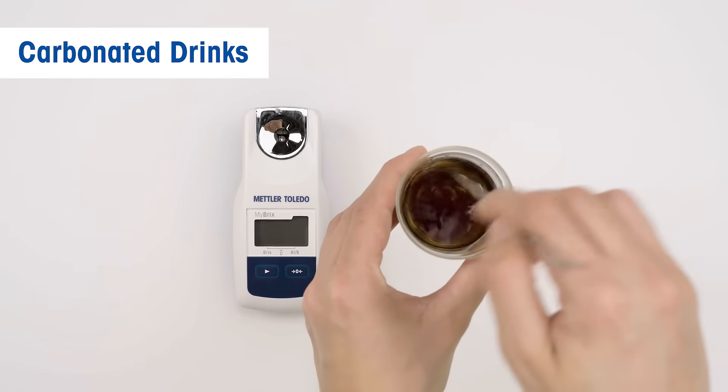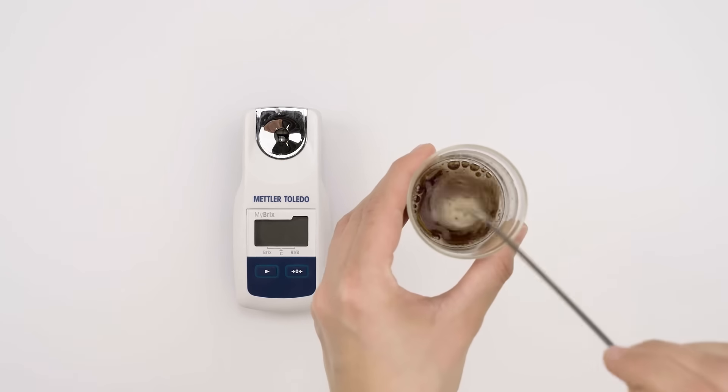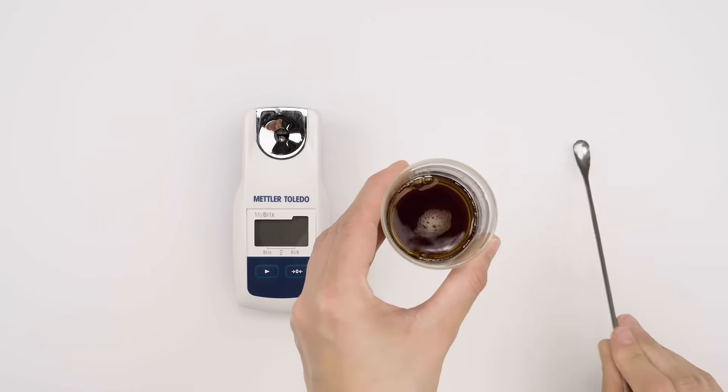Carbonated drinks can be measured directly, but for best repeatability it is recommended to degas the sample prior to the measurement.